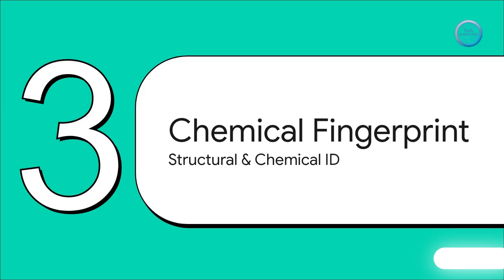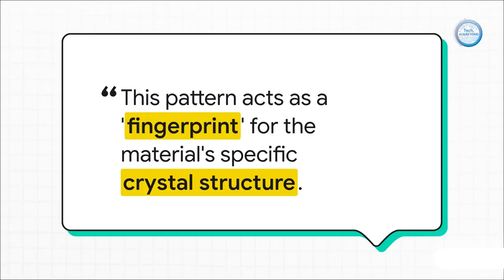It's like the difference between having a photograph of someone and having their DNA profile. The photo tells you what they look like, but the DNA tells you who they fundamentally are. To do that, we need techniques that probe the very nature of the material itself, its crystal structure, and its chemical bonds. This is how we confirm what we've actually made. So let's start with that fundamental identity. How do you figure out the precise, ordered arrangement of atoms?